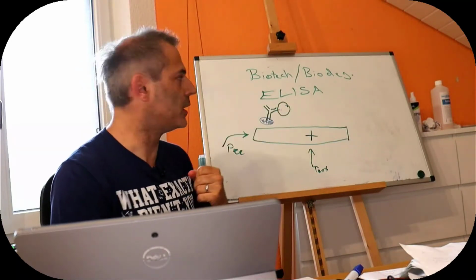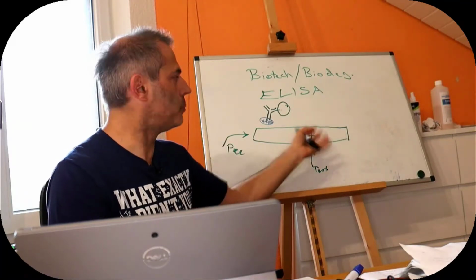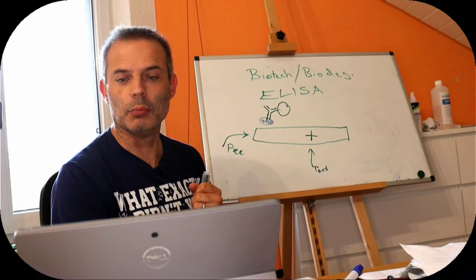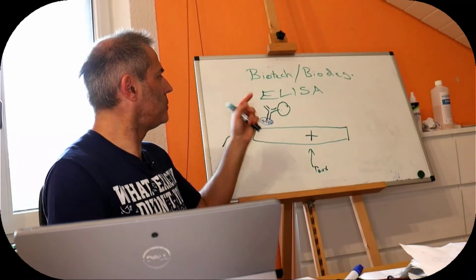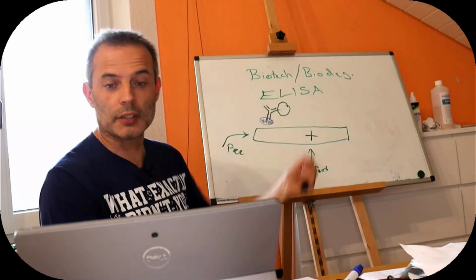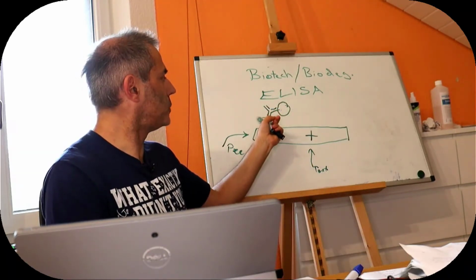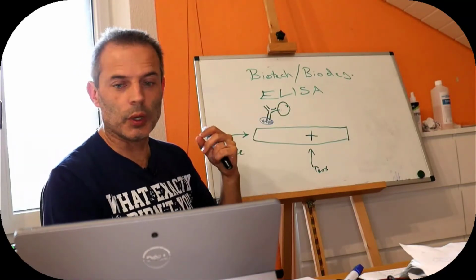So what we need for that is some way for it to be stopped at that point, and we also need antibodies because they are a good way of doing that. So our antibody is a protein. It's got an amine group at one end and an acid group at the other end, so we can imagine we can attach things to those. We can attach our dye to one end.